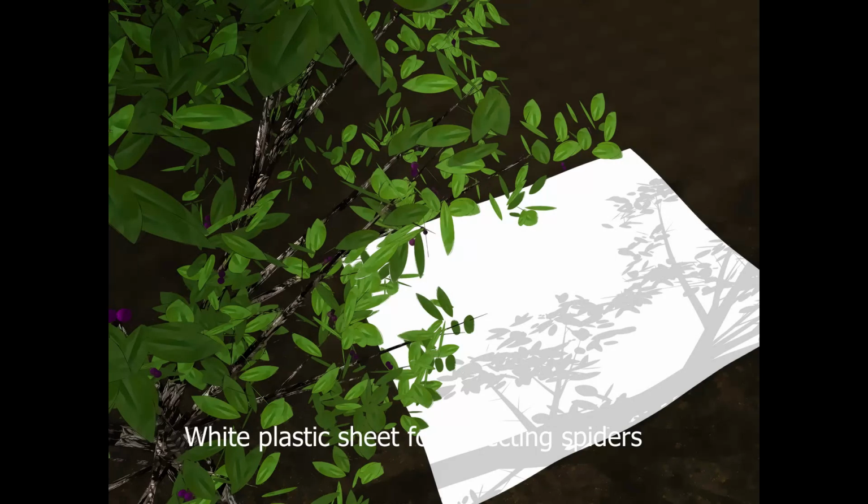Along with the spiders, some other insects also fall on the white sheet. Because the sheet is white in color, we can easily see the spiders on the sheet. If we use a black sheet, we can't see spiders easily on the sheet. The method is called inverted umbrella method. There is no necessity that we have to use an umbrella itself. A white plastic sheet or a white cloth can be used to collect spiders. This method is mainly used to collect spiders living in the branches and leaves.